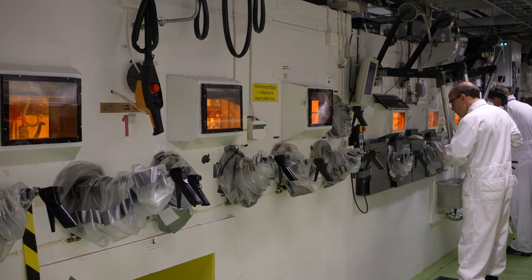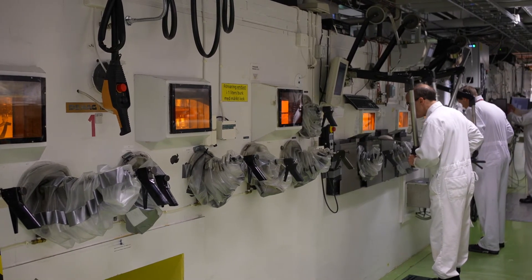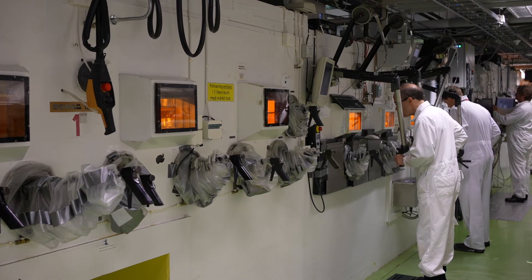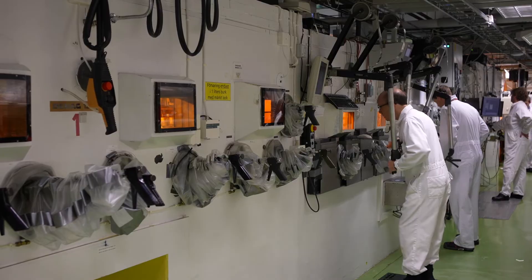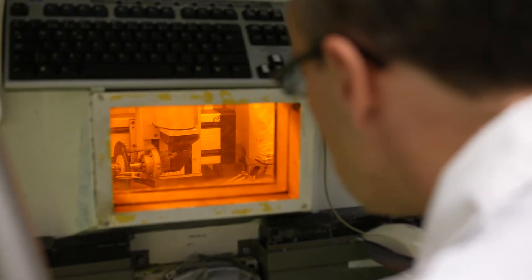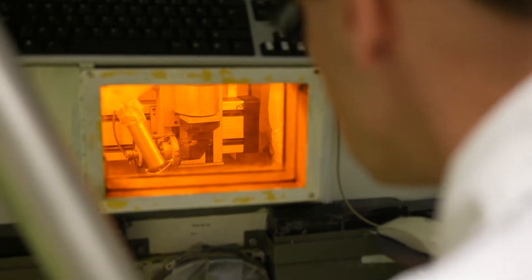The linked hot cells contain facilities for grinding and polishing metallographic samples. Two optical microscopes for imaging and dimensional checks, and an inspection camera for documentation are available. Micro-hardness measurements through a micro-hardness indenter can be performed in the linked hot cells.